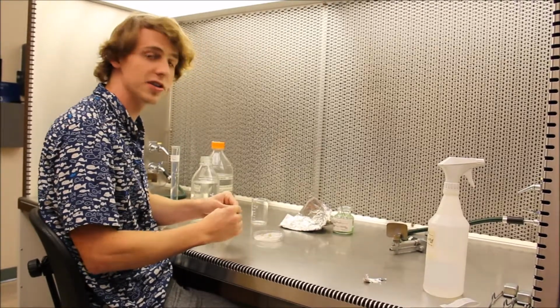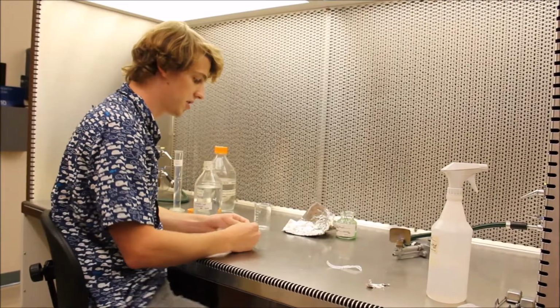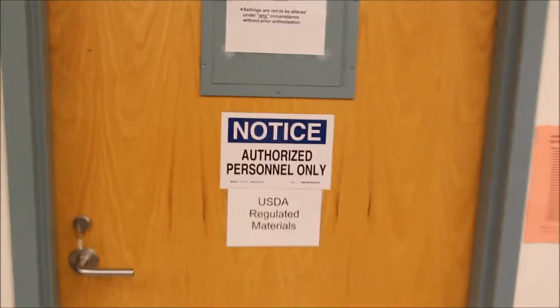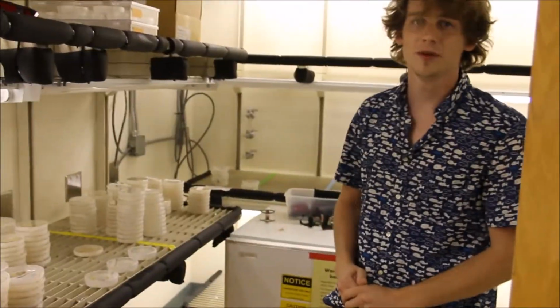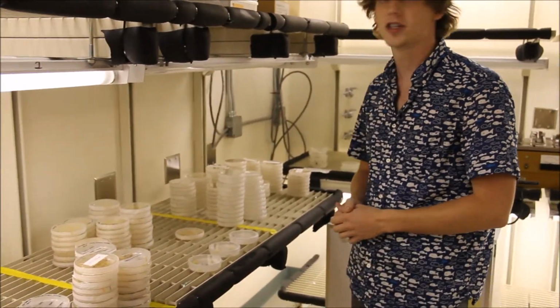At this point it is ready to go to the dark room for 3 days to help it undergo germination. And after 3 days in the dark room, we'll move it to the light room. That's it. Oh, hey there. 3 days after seed sterilization, we need to move our seeds to the light room. In the dark room, it's useful for germination.